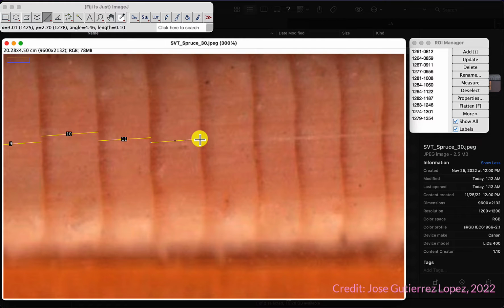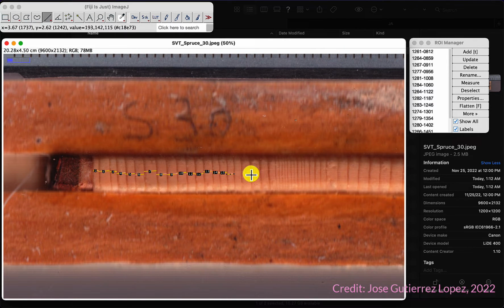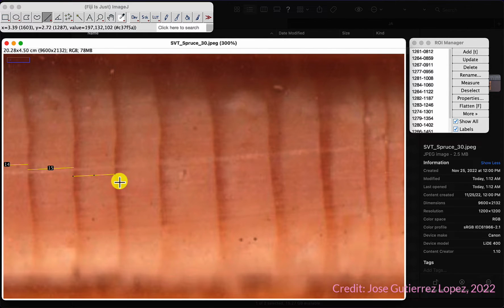Alright, let's see. This sample happens to be super easy. There are others that are just really difficult, especially some birch trees in the late years. They're quite tricky. I forgot to press T there, I guess. Yes. Done.